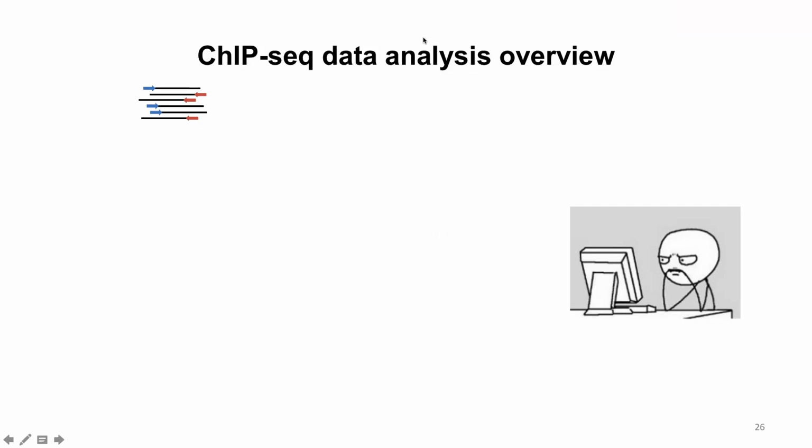At Affymetrix, we did it on genomic tiling arrays, which have the same unbiased character as ChIP-seq. In Tom's group, me and Simon Collier, first authors, we published the paper in Cell that was the first unbiased ChIP mapping. That's notable. It's a citation classic. I just wanted to throw it out. Yeah, definitely. Thanks, Stefan.